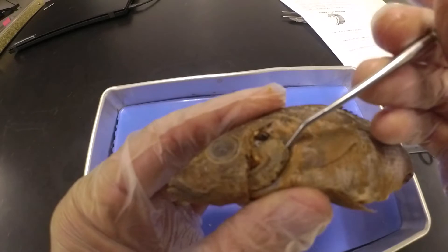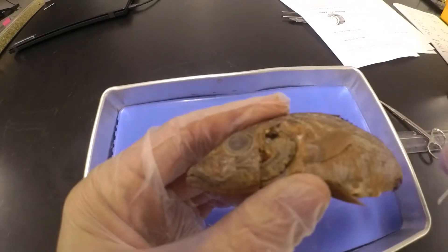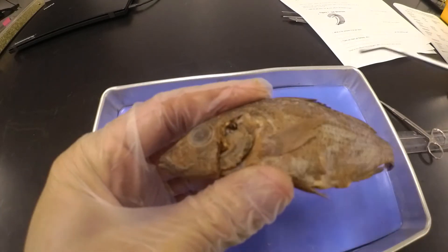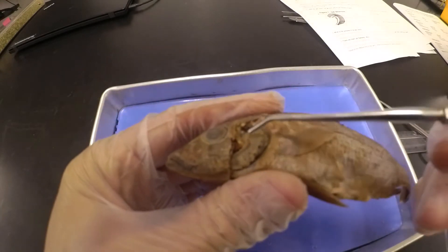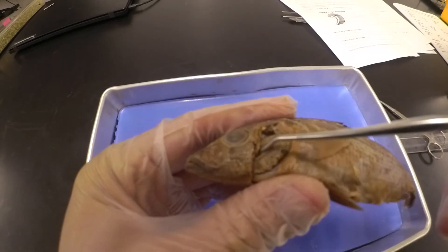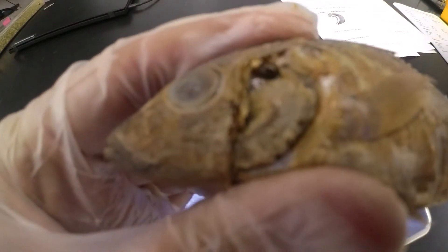Hopefully you know by now gills are used for gas exchange — for the fish to take oxygen from the water. Next, if we remove these gills, we'll be able to look at some of the components. I'm going to take them out here in a second.